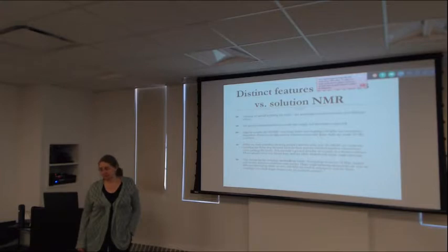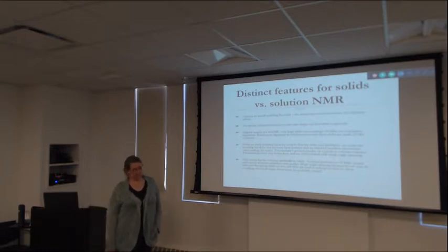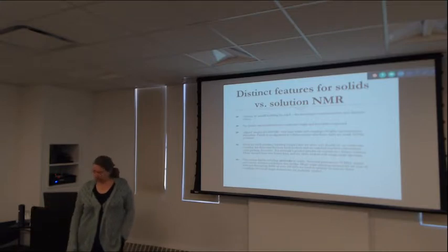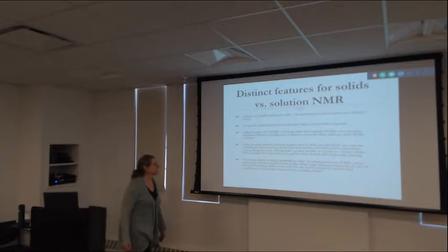It's not a few ppm. It's, you know, like 100 ppm. It's the full range of the normal spectral width in some cases. Depends on the functional group. So those are big opportunities. If you can orient your sample differently and you can see a shift that's large, it could be a very sensitive way to probe structure.